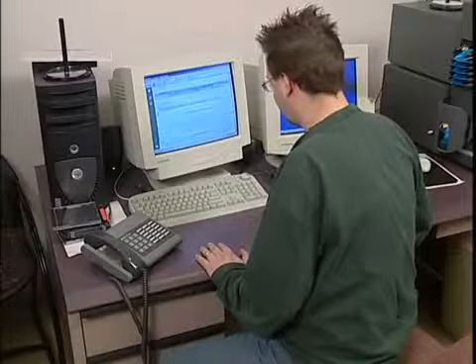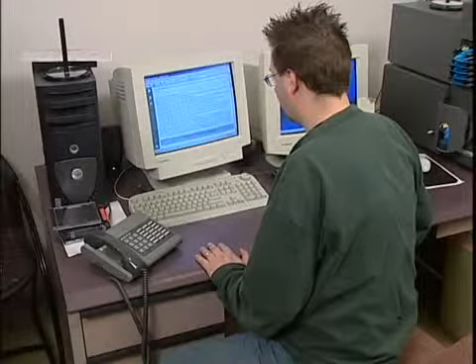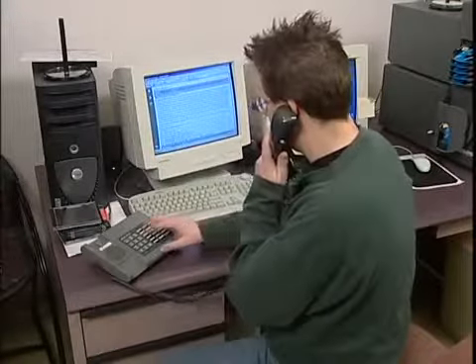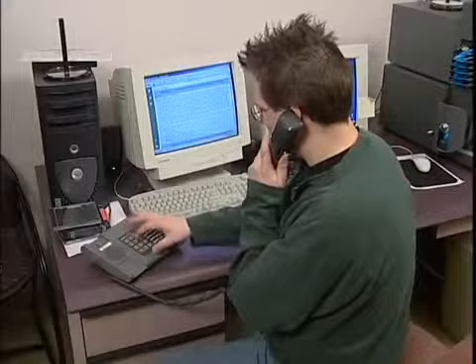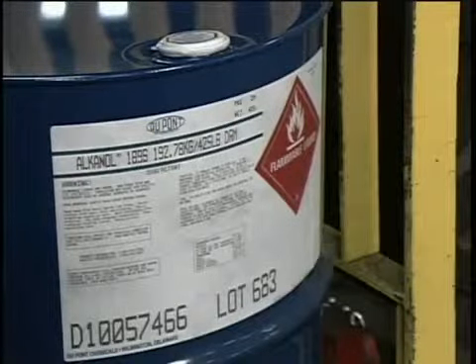Section 1 of the ANSI MSDS lists the commonly used names of the chemical. The name, address, and phone number of the manufacturer is also given, just in case you need more information on the material. You will find the same chemical name and manufacturer on the container's label.